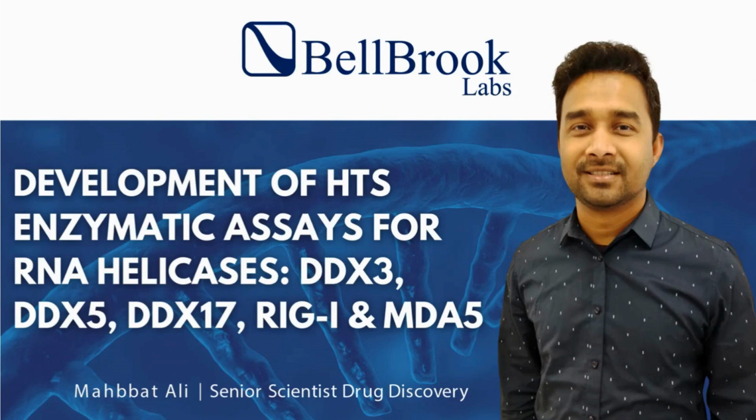Hi, thank you, Justin, for the introduction. I'm super excited today about this webinar. We will be sharing about the development of high-throughput screening enzymatic assays for some RNA helicases.